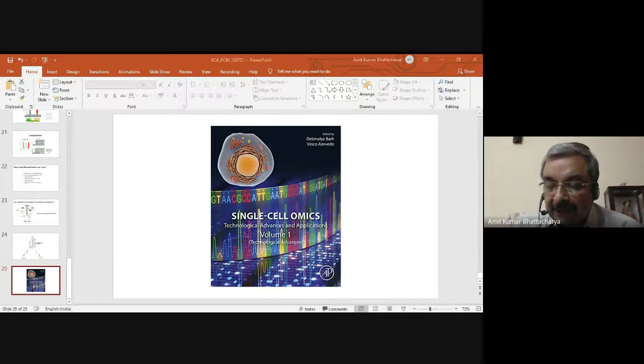But now if you know the spectral profile of your autofluorescence, and you know the spectral profile of your 2 individual dyes, and now you take one picture in which you have all the 3 colors present: autofluorescence, the signal from the first dye and the second dye, and now you run an algorithm.